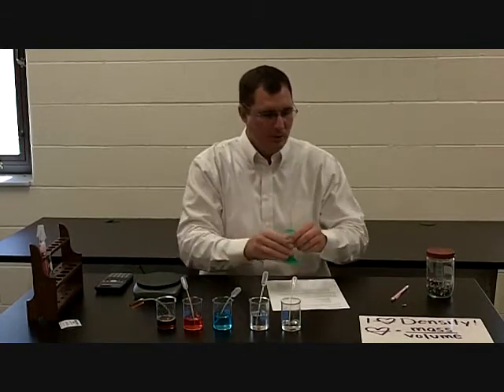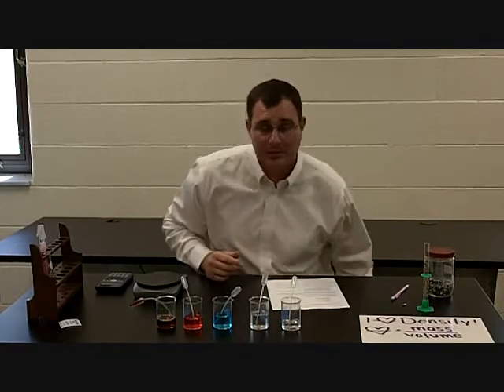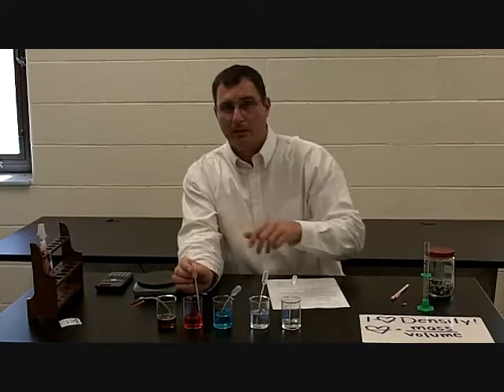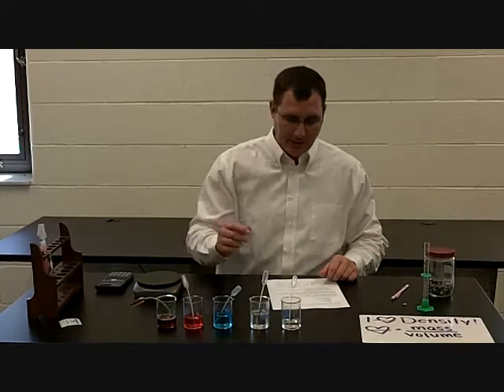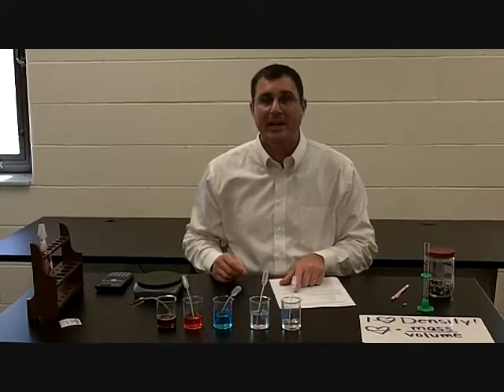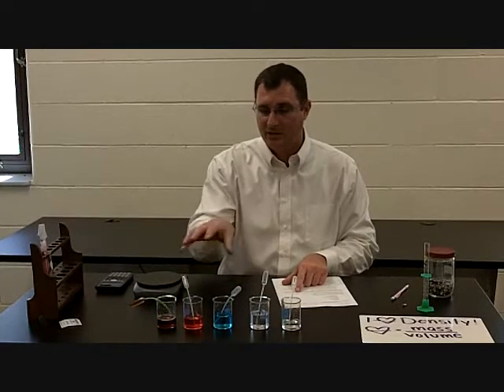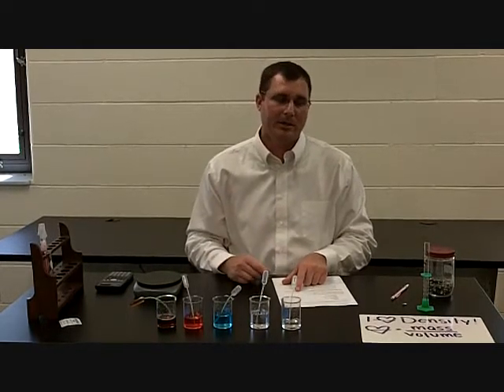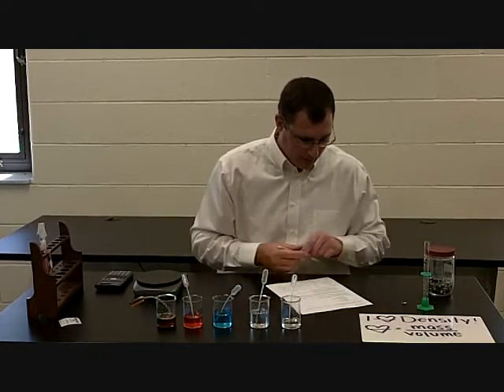Alright, now usually we tell you not to assume everything's the same, but for the sake of this lab, we're going to make the assumption that all of your pipettes weigh 0.9 grams and that they all hold 4.8 milliliters. So as we do the masses of these other fluids here, that will be important to helping us calculate density. So I'm going to go ahead and write that down.